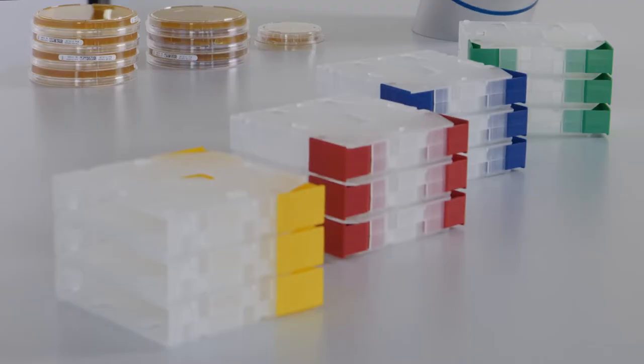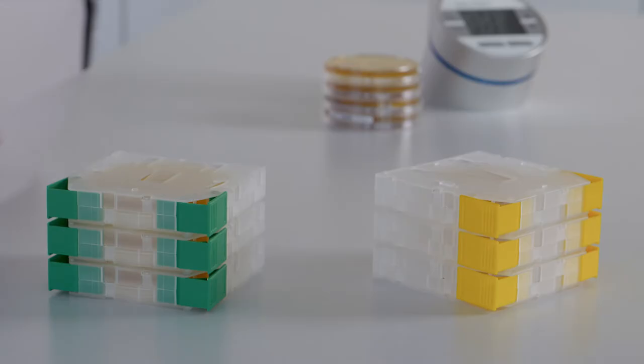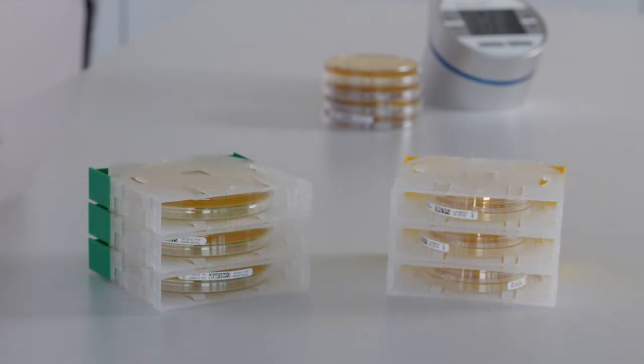The dispensers are available in green, blue, red and yellow. Each color can be used for a different culture medium. This makes it easy to distinguish them.